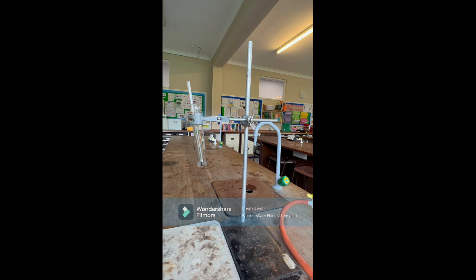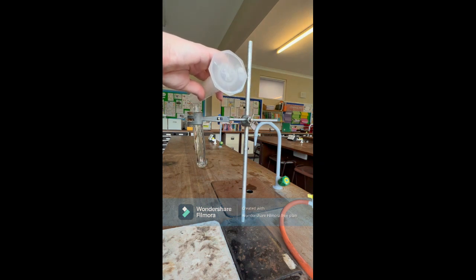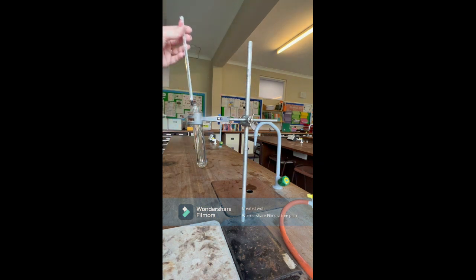I've got 40 centimetres cubed of water, which I'm going to pop in here. I'm going to measure that using a measuring cylinder, and then put in my thermometer. I'm going to leave my thermometer for a couple of minutes to acclimatise so I can measure the starting temperature of the water. It's really important that I measure the starting temperature because I am going to use the temperature change to work out how much energy is in my food.